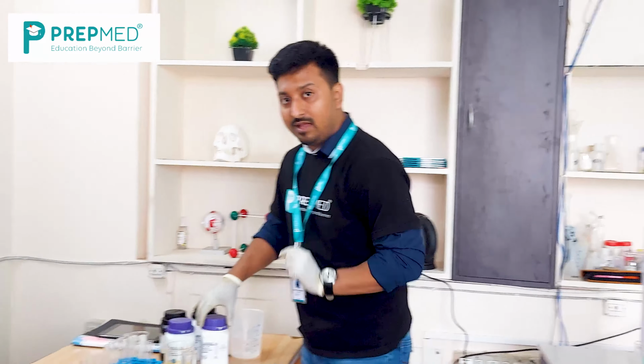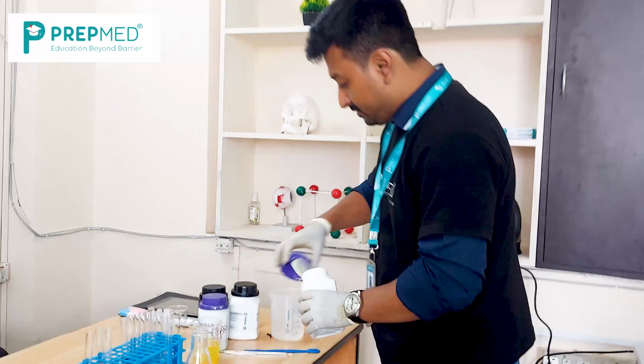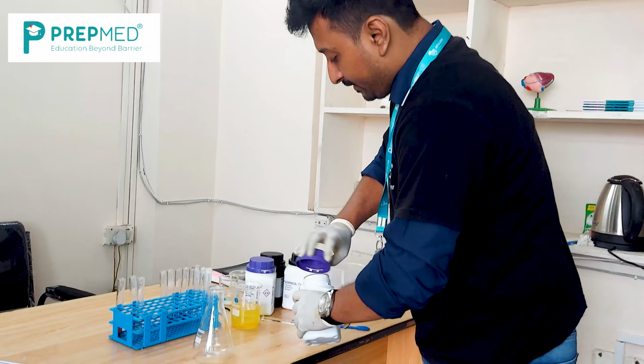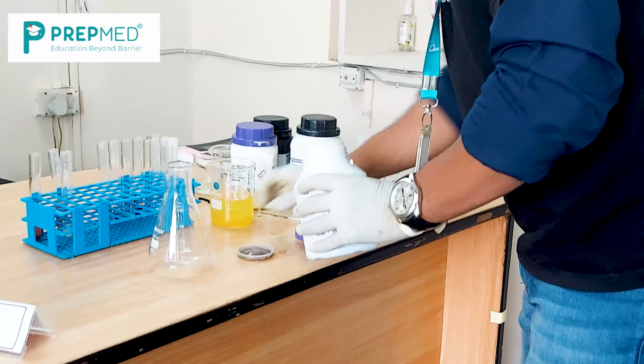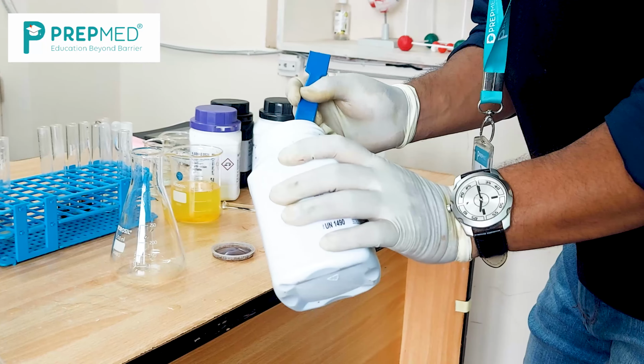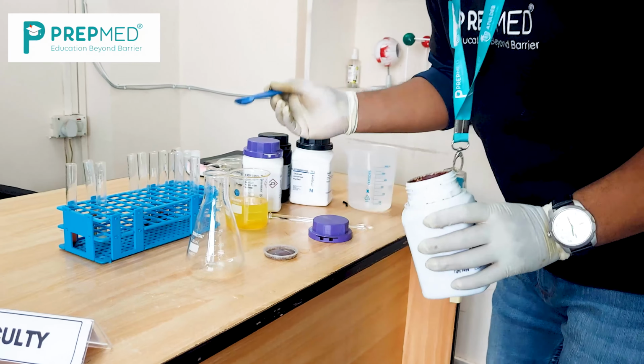We will take a small amount of potassium permanganate in the conical flask. Now taking a very small amount.